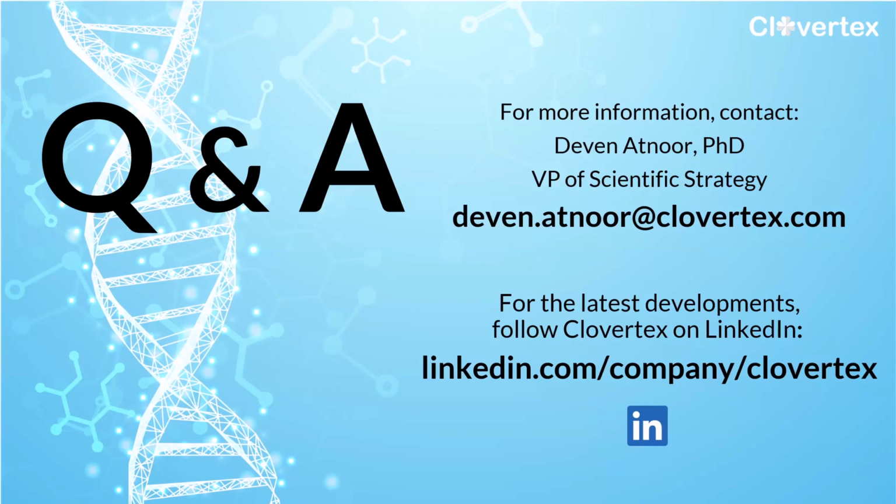Great, thank you. Here's a question from Sonia, who asks: I might have missed it. It's not entirely clear to me to what extent the computing settings are currently selected by an experienced person or automated. I assume the goal would be to let the computing cluster decide itself, based on 2D pre-processed data, how to allocate its resources for each dataset or sets of datasets from one compound screen.